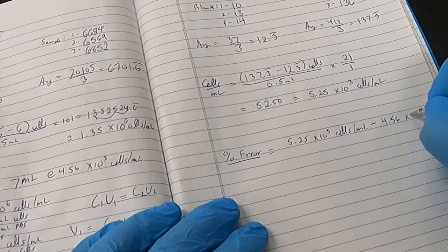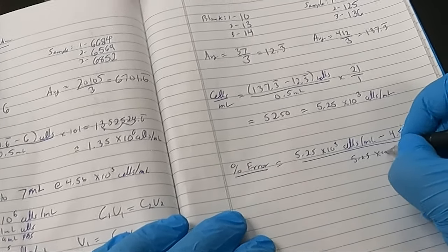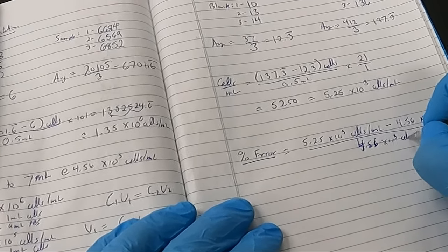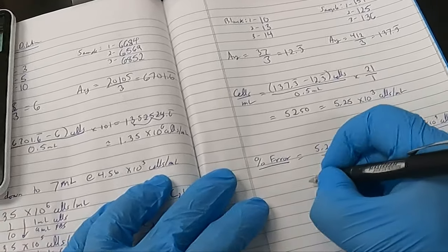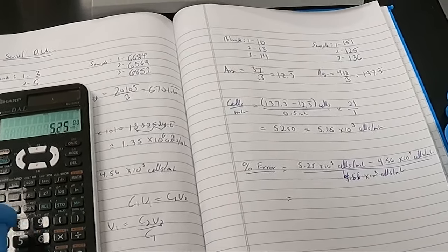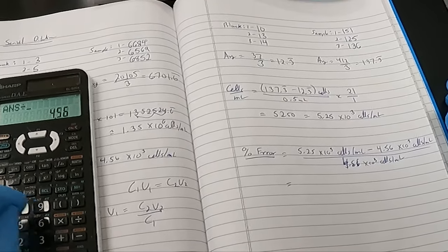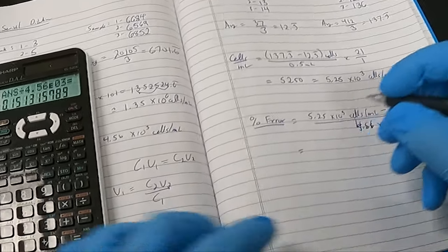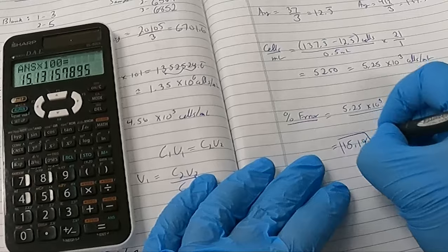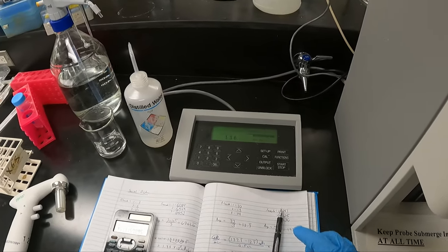I would like it to be within 10%. So we take our measured value, subtract away our desired value, we then divide by our desired value. Common mistake there. Again, I'm looking to be within 10% error. Multiply by 100 to make it a percentage. 15.1%. So, outside my 10%. I said this was a challenging one, so even I have room for improvement.